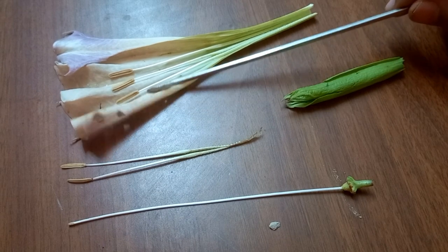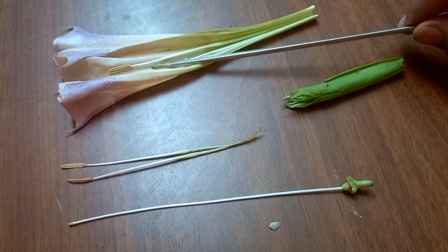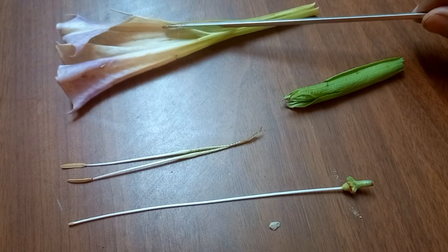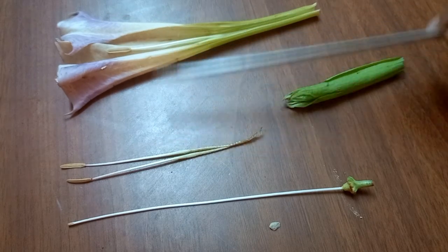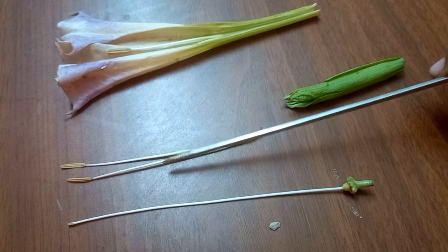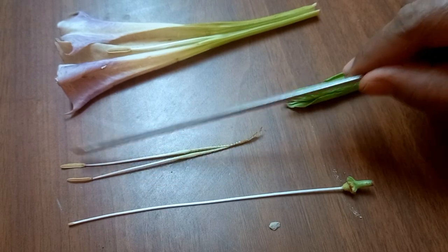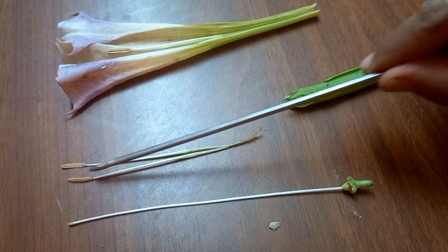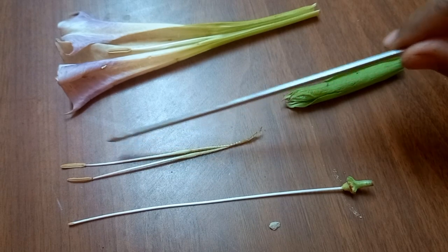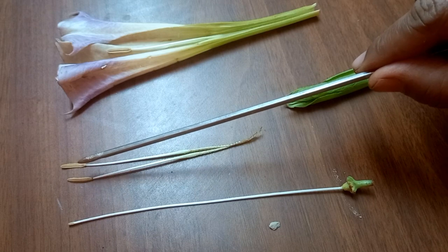Now after that, the next part of the flower is the male reproductive part. Those are the stamens, and these stamens are fused with the petals in dhatura. Now I have separated two of them so that I can explain the structure of the stamen. This is the male reproductive part of the flower, and it has two parts: the filament and the anther, and inside the anther are present the pollens.